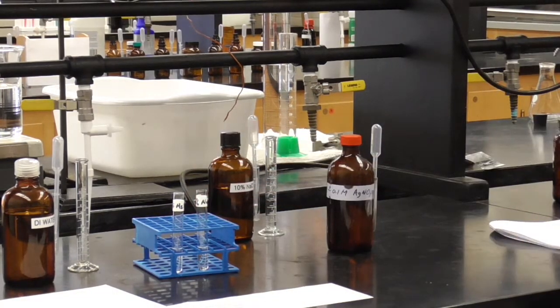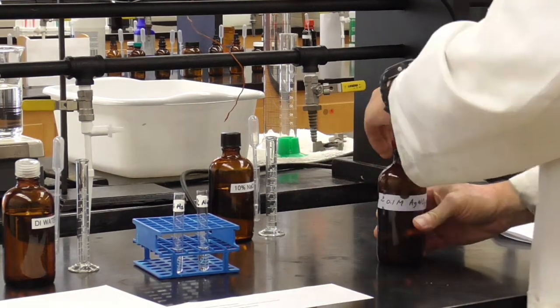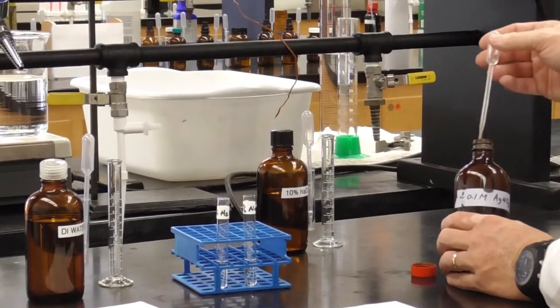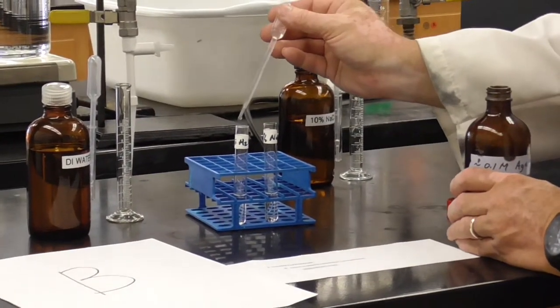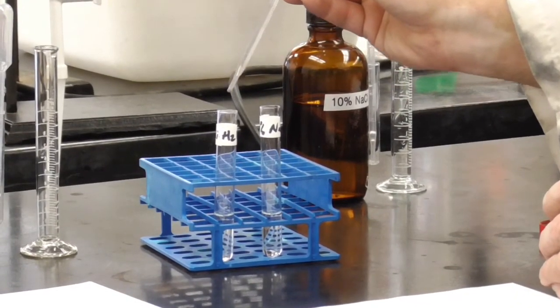Next, it says add 2 drops of 0.1 molar silver nitrate. When the silver nitrate goes in there, the silver cations react with the chloride anions to produce a precipitate, that is to say a solid that's not soluble. So if I put it in the negative, there we go.